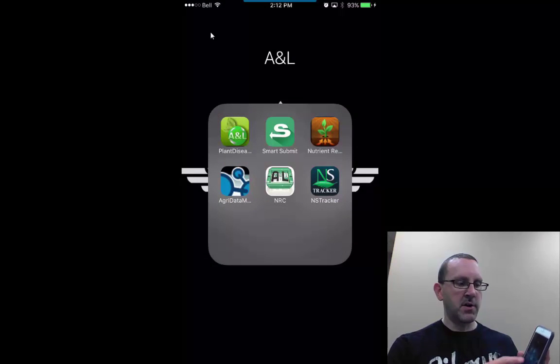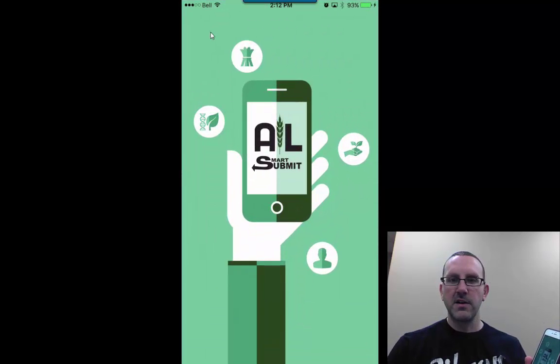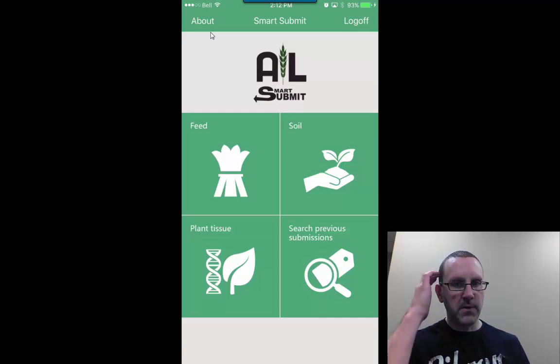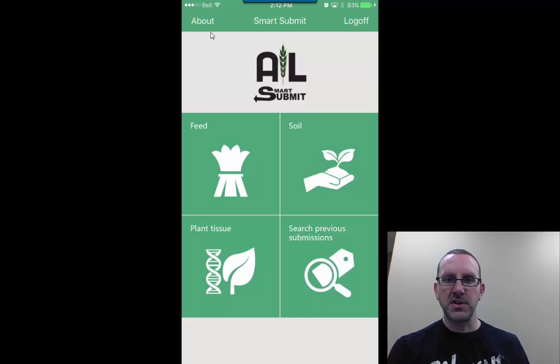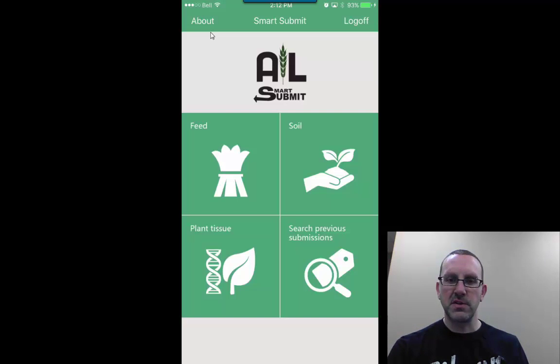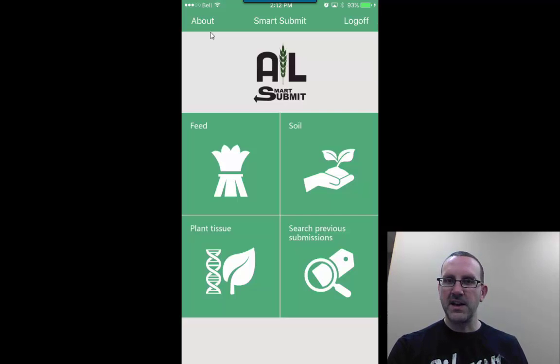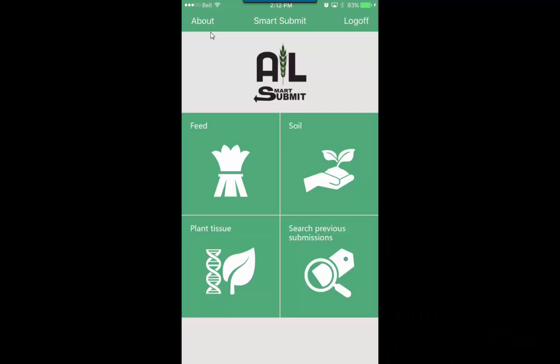Basically this is the app here. We're gonna go through the functionality of it. So we click on the icon and we're brought up with a selection of different options here. We can do feed submissions, soil submission, plant tissue submission, or search previous submissions. So you can go back in here and make sure that the sample were submitted correctly or if you've missed a field and that sort of thing.